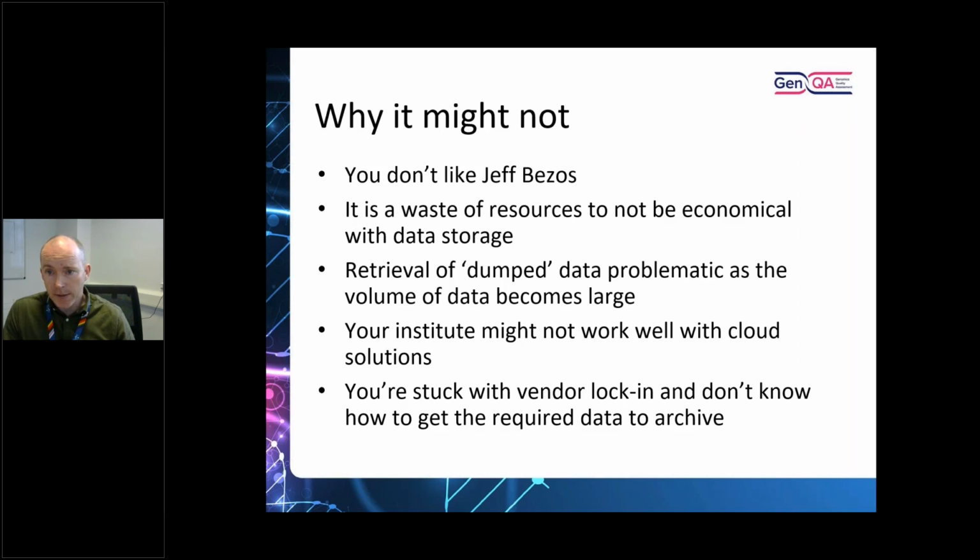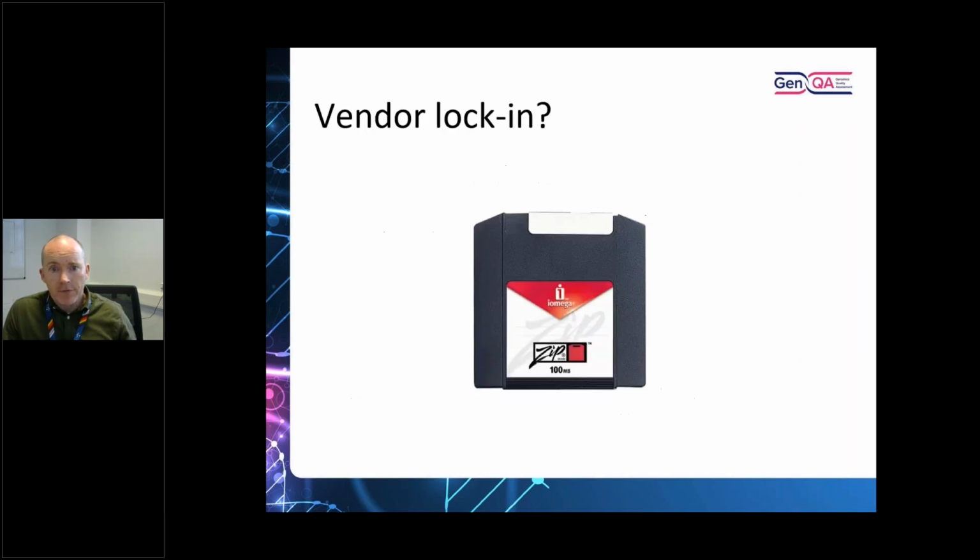So if we go to the next slide. Vendor lock-in is just the concept, and I'm sure most people are familiar with it, of being linked to a particular vendor. You can't get away from their system. For those of you old enough to remember, this is a zip disk. We have zip disks in our department, and we've no zip drive. You can't even buy them for a lot of modern computers. So we have a lot of data stored on these, and it goes into long-term storage, but it's stuck on a zip disk.